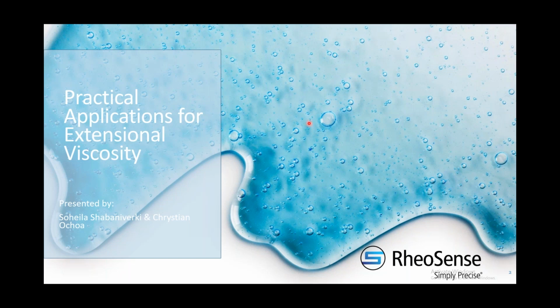Thank you, Eden, for your nice introduction. Hi, everyone. Welcome into our webinar today. I'm Soha, and today I'm here with my colleague, Christian, and we're going to talk to you about practical applications for extensional viscosity and also give some quick background about our technology, and then we're going to share some extensional viscosity data that have been collected by e-VROC technology. So let's go ahead and get it started.